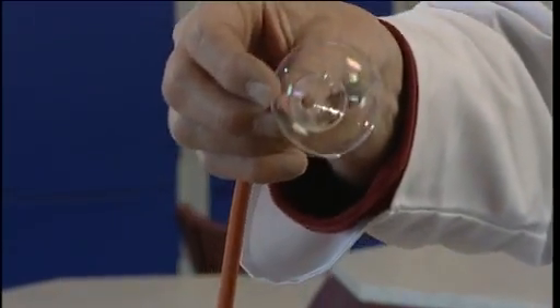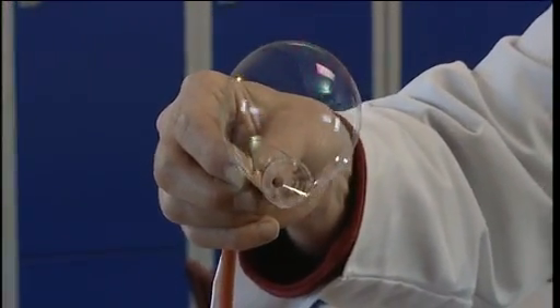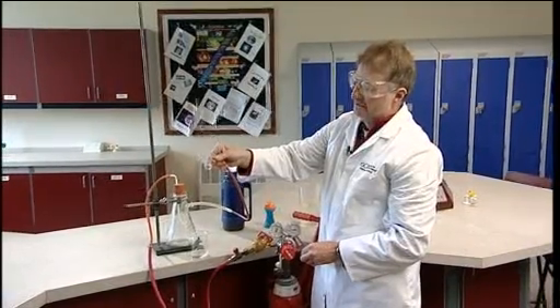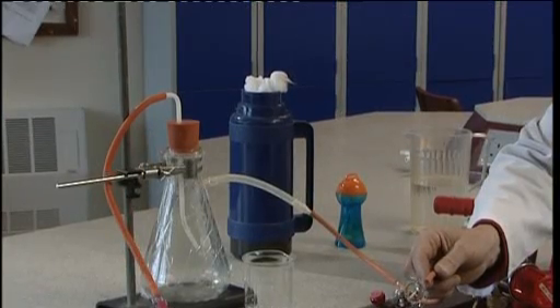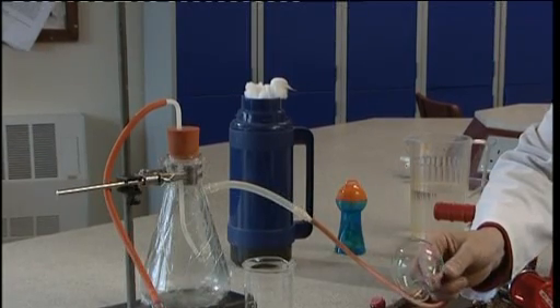These of course float due to the fact that hydrogen is much less dense than air. They can be ignited with a responsible assistant holding a lighter on a stick. It's vital that they do not attempt to light the bubbles while the bubble is still attached to the bubble pipe.